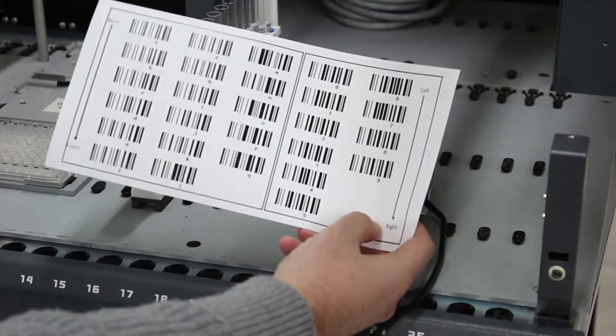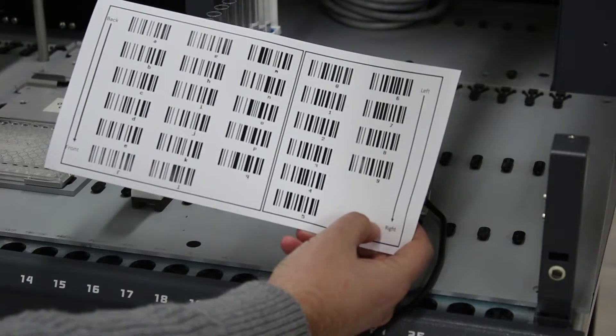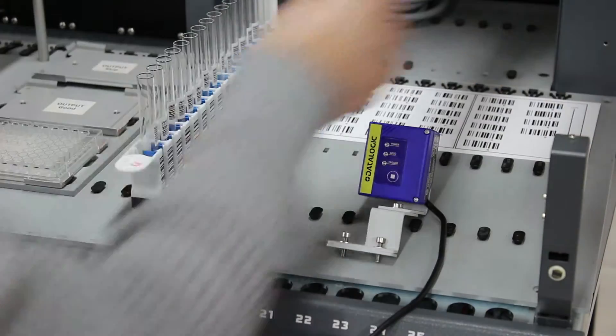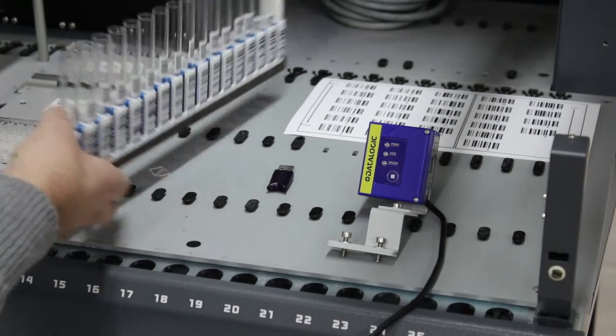Barcode sticker page for labeling a single regular TICAN tube rack for 16 tubes.